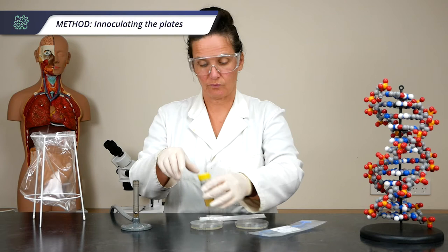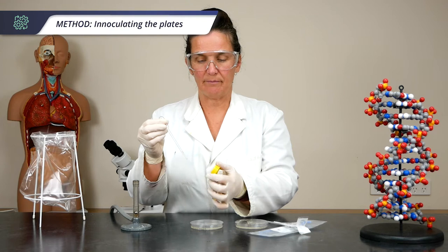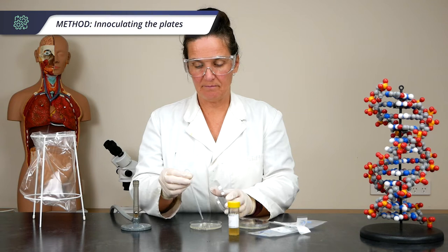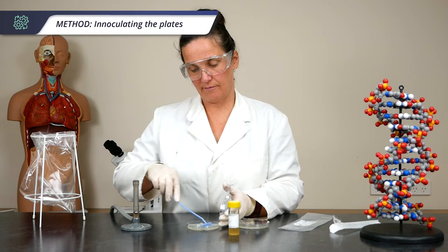Take your bacteria next to the flame, open it up and quickly pass it through the flame. Take your sterile pipette — you only need a few drops of this because it goes a long way. Pop it onto your plate and then use the spreader to spread it out to make a nice even lawn.